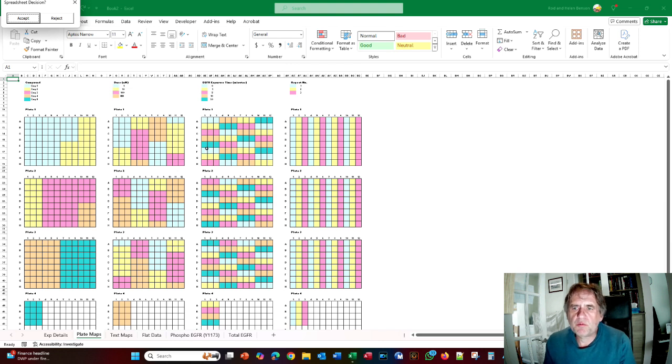And the other important thing to realize is that up until now, we've always selected a subplating area that is greater than half a plate. But this time the subplating area was 3 columns, and 3 columns is divisible into 12. So because of that, it still fits nicely. So there is absolutely no leftover space in terms of columns. So what it's done, you can see, is it's now plating the EGFR dose down in columns and the repeat numbers in rows. So now you can see the 5 time points fit nicely in rows A to E.